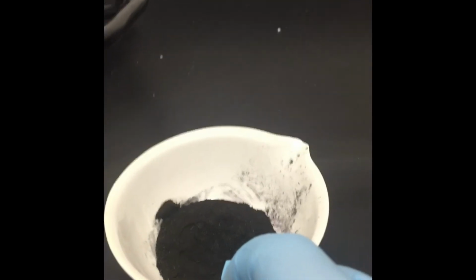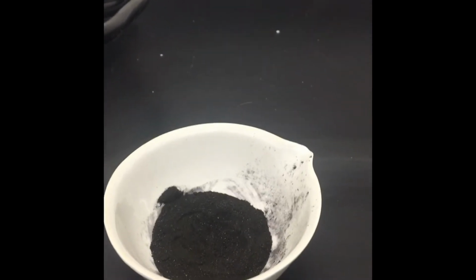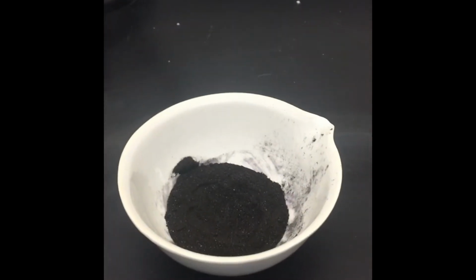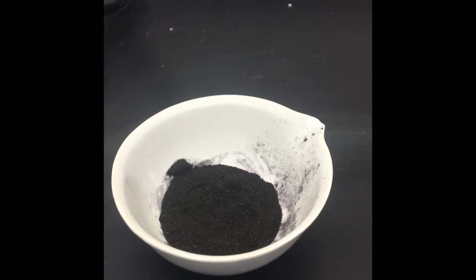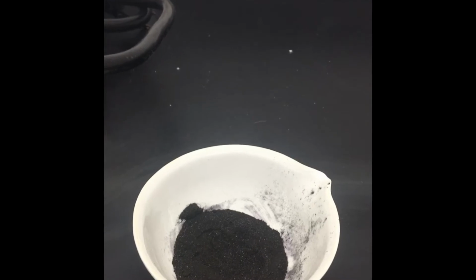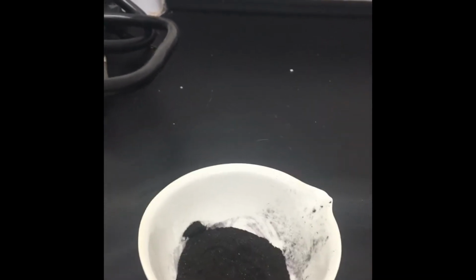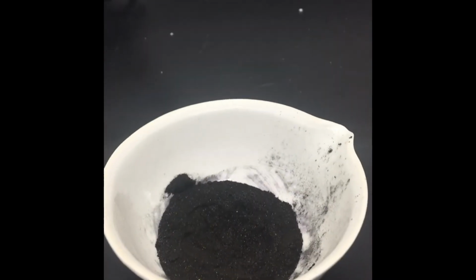And what we're going to add, similar to what we did before with the gummy bear, is a source that has carbon, hydrogen, and oxygen. So I'm going to add glycerol. Glycerol is an alcohol, sometimes called glycerin. Maybe you have heard of glycerin soap. So that's exactly what glycerin is.